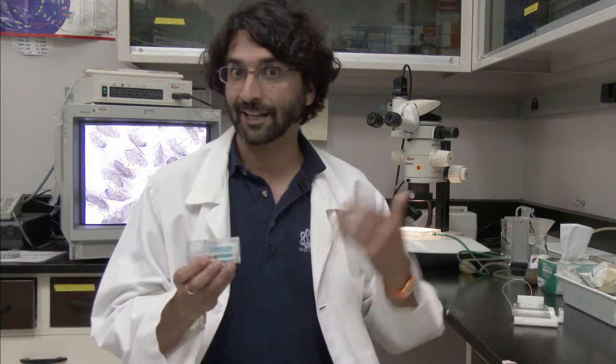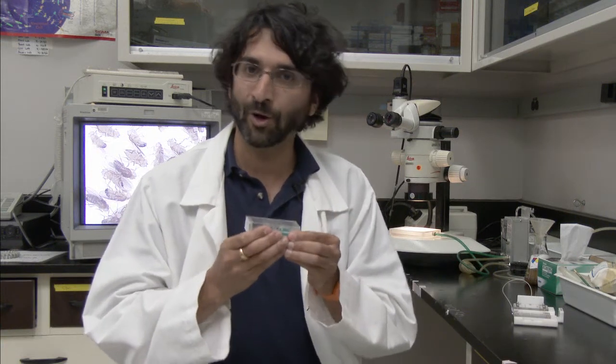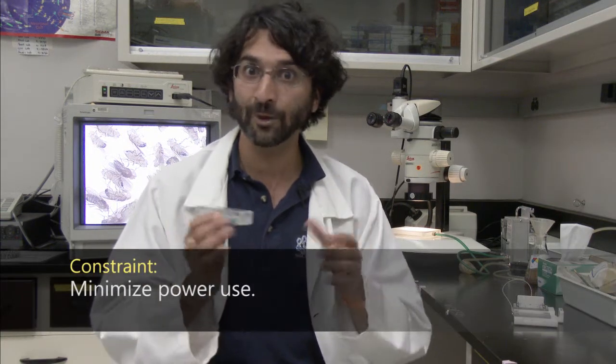Flies operate best between 20 and 25 degrees Celsius, and if you leave your lights and camera on for too long, it's going to get too hot. So we need to think carefully about what is the timing of the cameras and the lights such that all the scientific requirements are met and our flies are still alive. Now, if it gets too hot, one way to dissipate away that heat is using fans. So we could put one big powerful fan that removes all the heat, and that would be good.